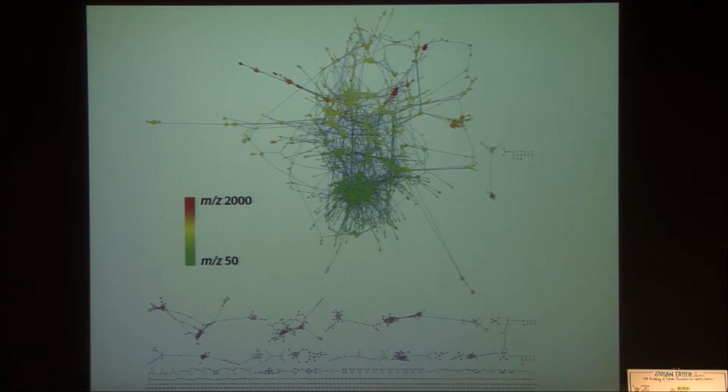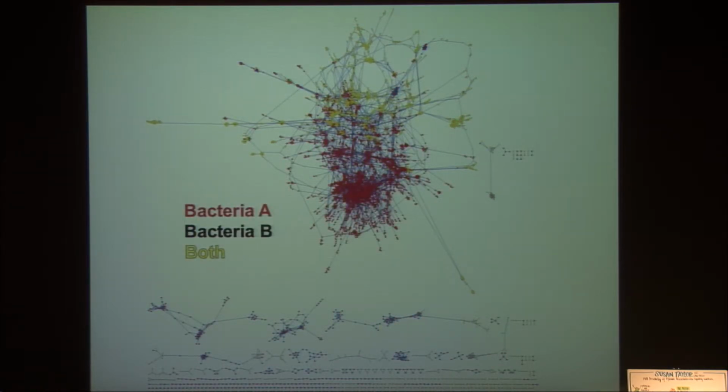Often what you will see is that related masses cluster very nicely based on that barcode signature. Occasionally we'll see multiple masses correlating in different regions. And with the sugars, for example, there's a large number of different masses of sugars that typically correlate in specific regions. But you can also add other attributes. So here we say bacteria A or bacteria B, but you can also do organelle A versus organelle B. So to me, that's no different at that stage.